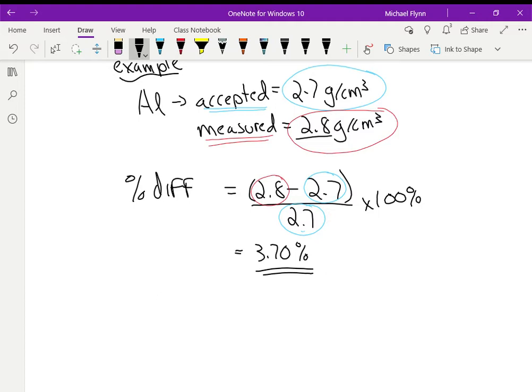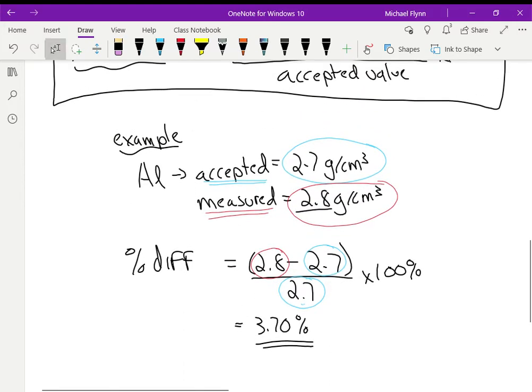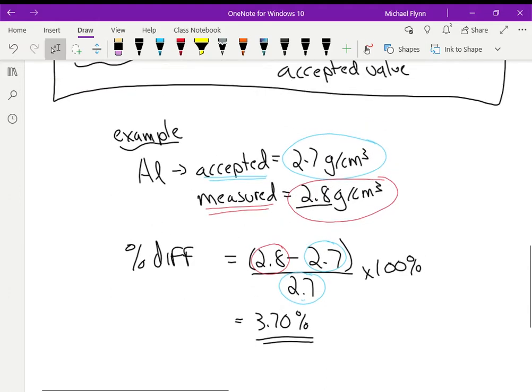It's only 2.7 centimeters. So if you're off by, not a centimeter, but 1 millimeter, let's say, you could have a small deviation in the answer of 1 or 2%. Anyway, that's how you find percentage difference. I would like you to do that for all three of the remaining metal blocks, the iron, the brass, and the copper blocks, and determine the percentage difference.